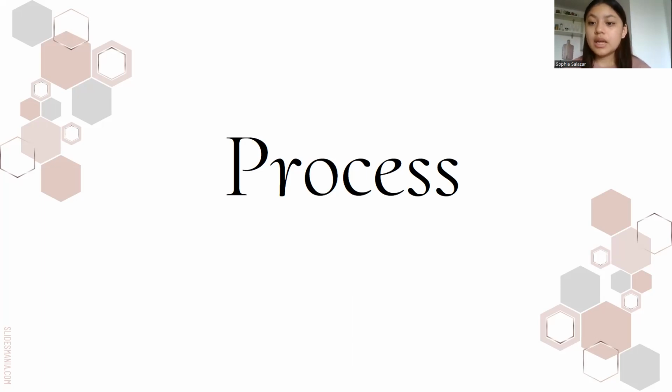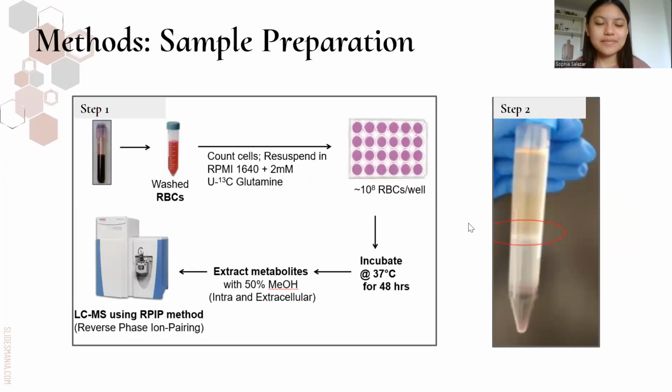The sample preparation was done by my mentor at the University of Calgary, while I analyzed the data with my mentor for my paper. Now I'm going to talk about the sample preparation, which again was done by Rajni. Red blood cells and white blood cells are prepared differently, so I will explain how to do both.